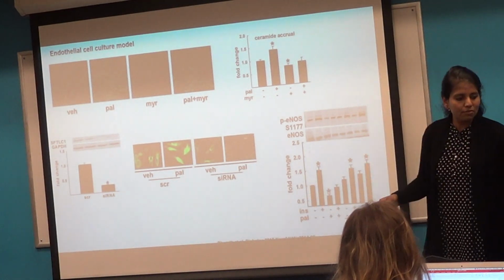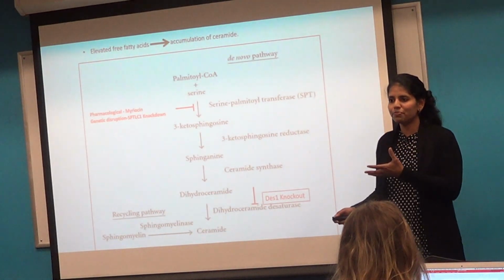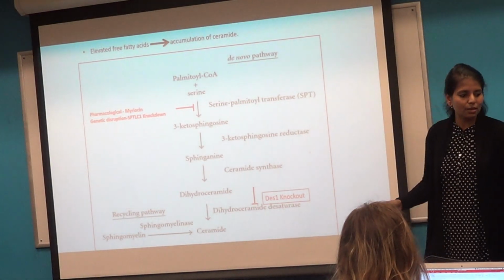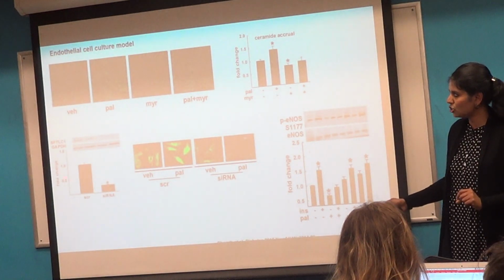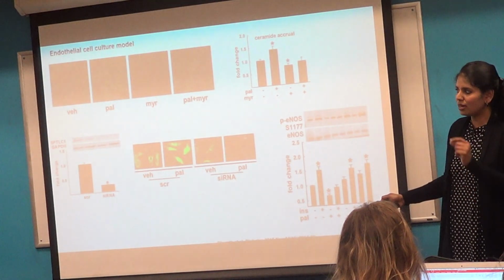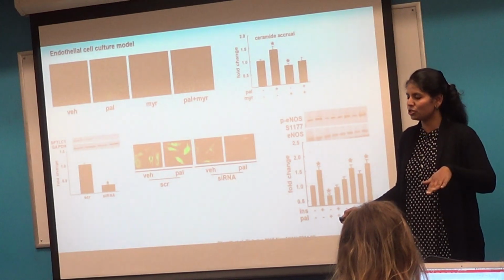Now if you see the previous slide, you had this Myriocin. It's easy to treat cells with the drug Myriocin. And we did a silencing knockdown too. You'll see the same data down here. This is something we do to confirm the efficiency of the knockdown, looking at protein production. If you use that siRNA, you have less protein production, meaning you are successfully knocking down that protein expression.